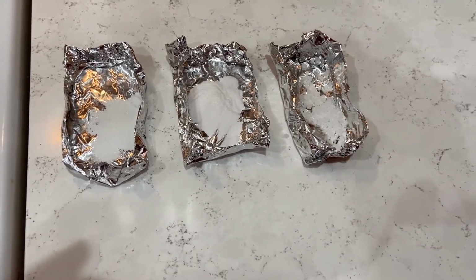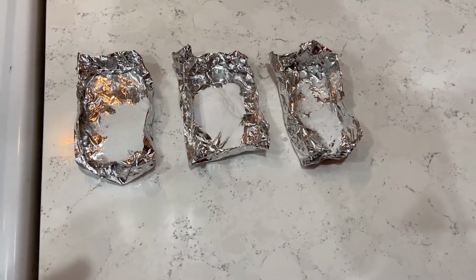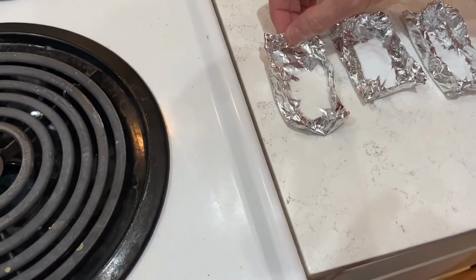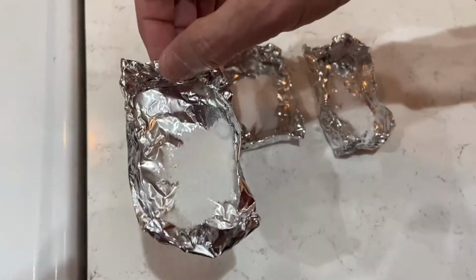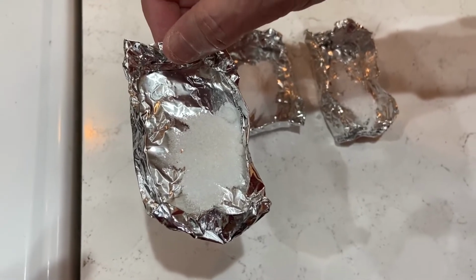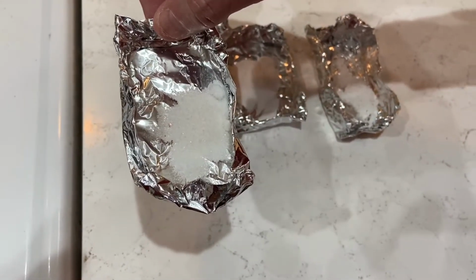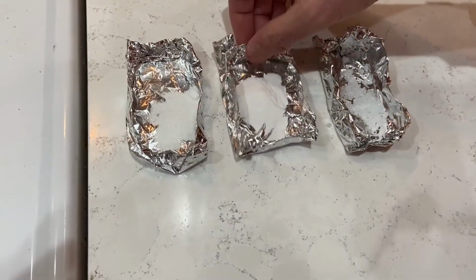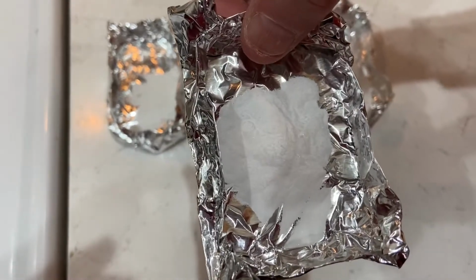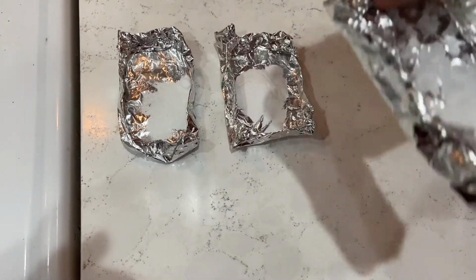So in this lab, we have 3 different substances, and for now we're just calling those substance A, which is this one right here. And you'll notice that these are all white powdery substances, but they do have slightly different grain size and lusters, shininess to them. This is substance B. And this one is substance C.